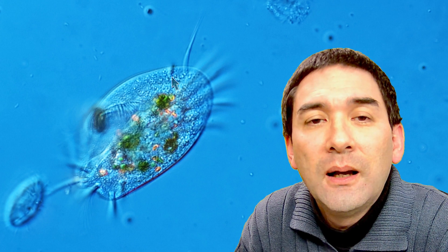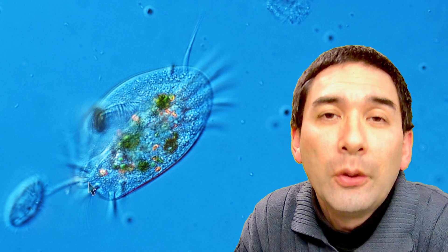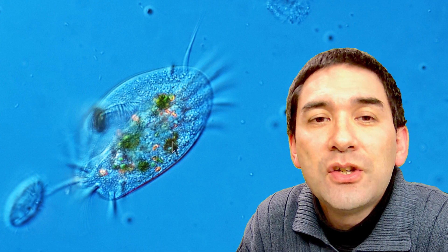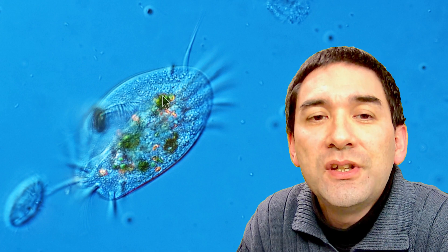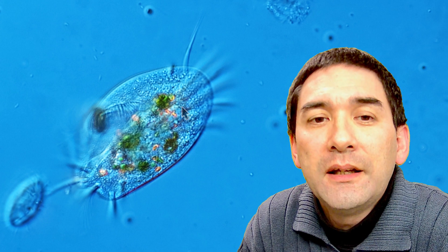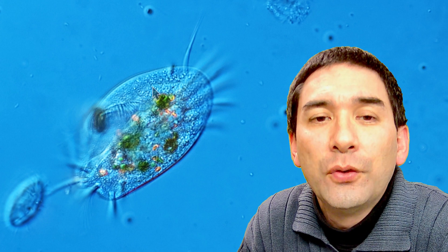There's also a single-celled organism, possibly a Euplotes is the name. And you see there are these green spots in here, and those green spots are most likely algae that it has eaten. So it's not a photosynthetic organism.